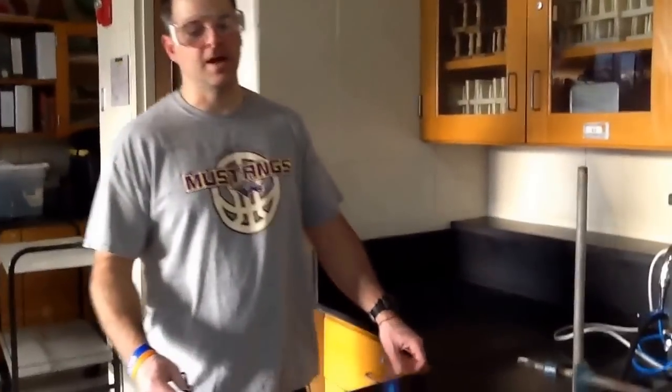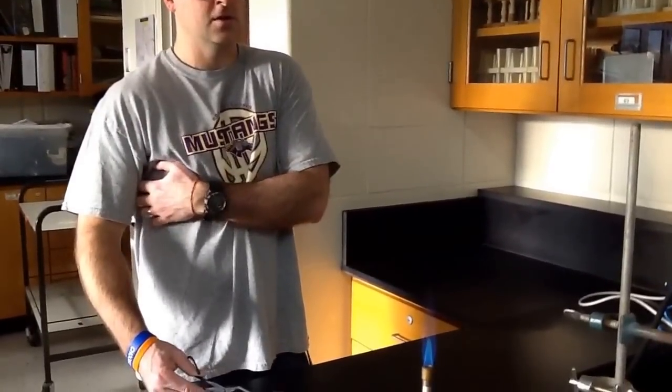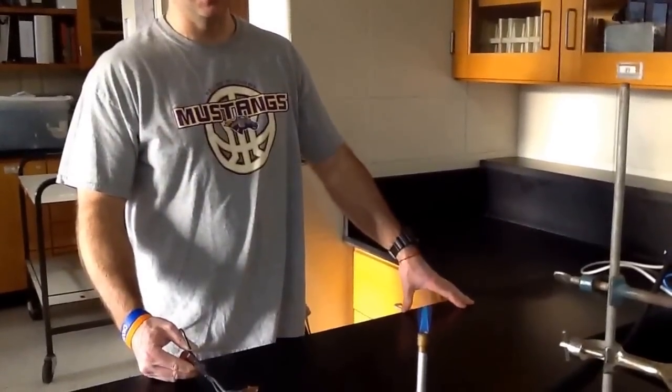Hey everybody, it's Mr. Mott. What we're going to do is show you our 5 different types of reactions that we've covered in class. So first one's going to be a combination reaction.